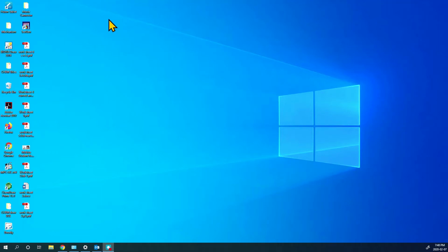Hello everybody, this is Larry Lee and this is a video tutorial for Chemistry 110 at Camosun College for experiment number 2, where I'll show you how to use Excel to plot a time versus temperature graph.